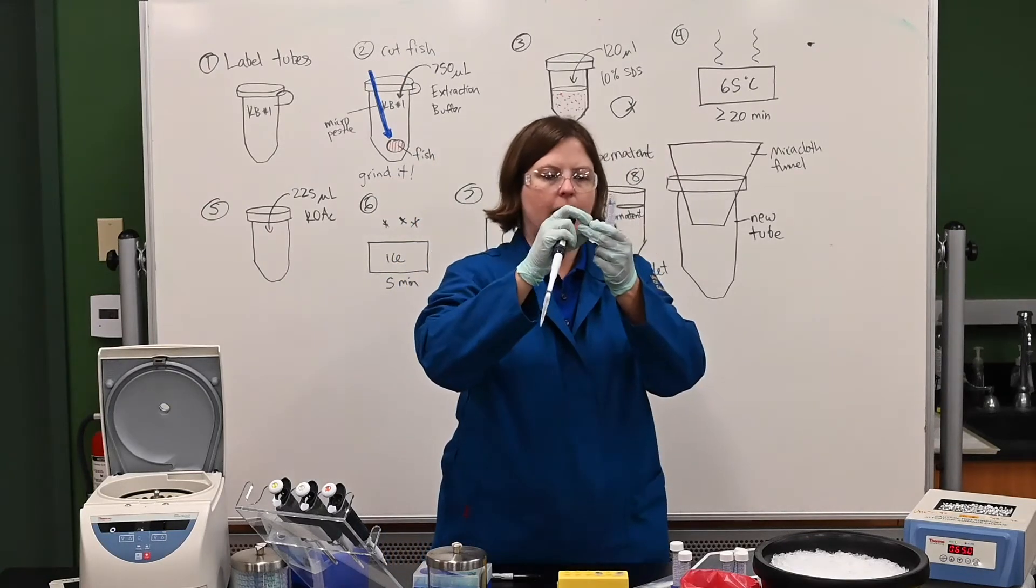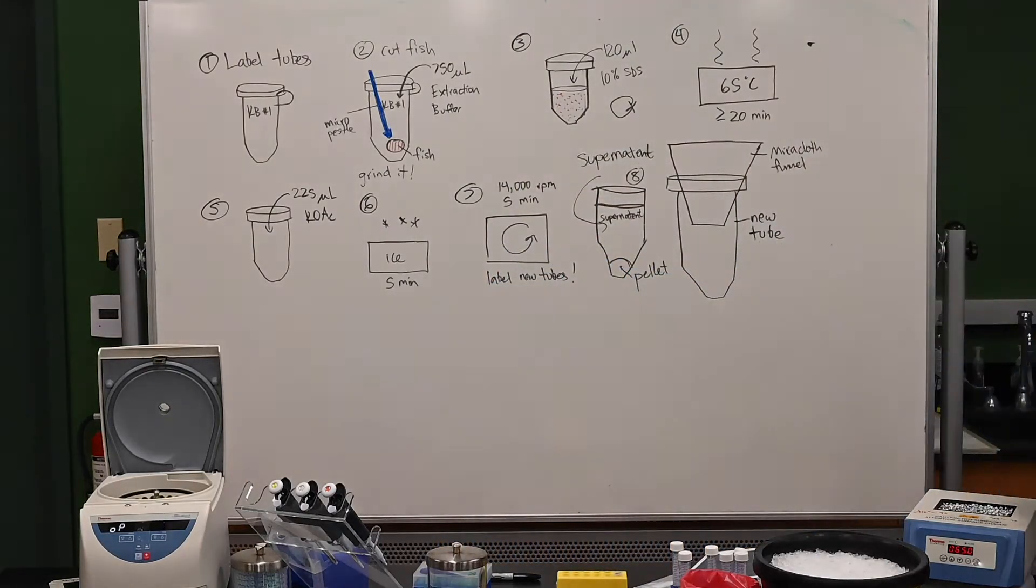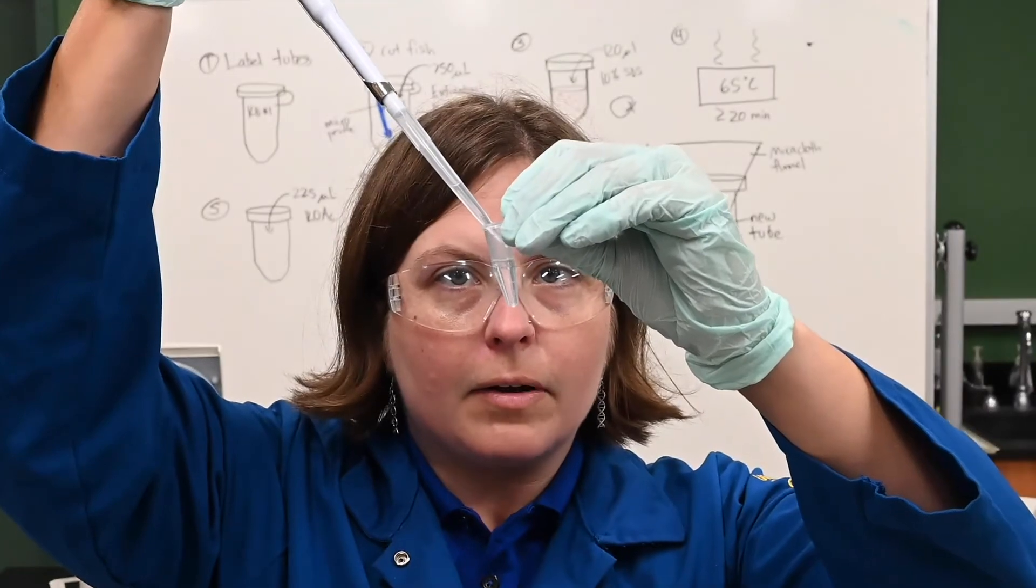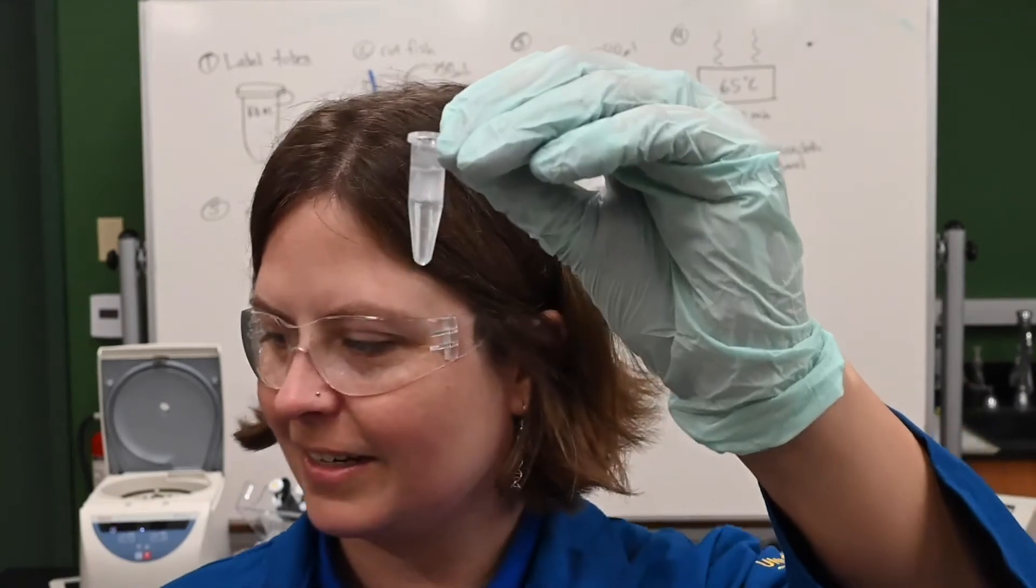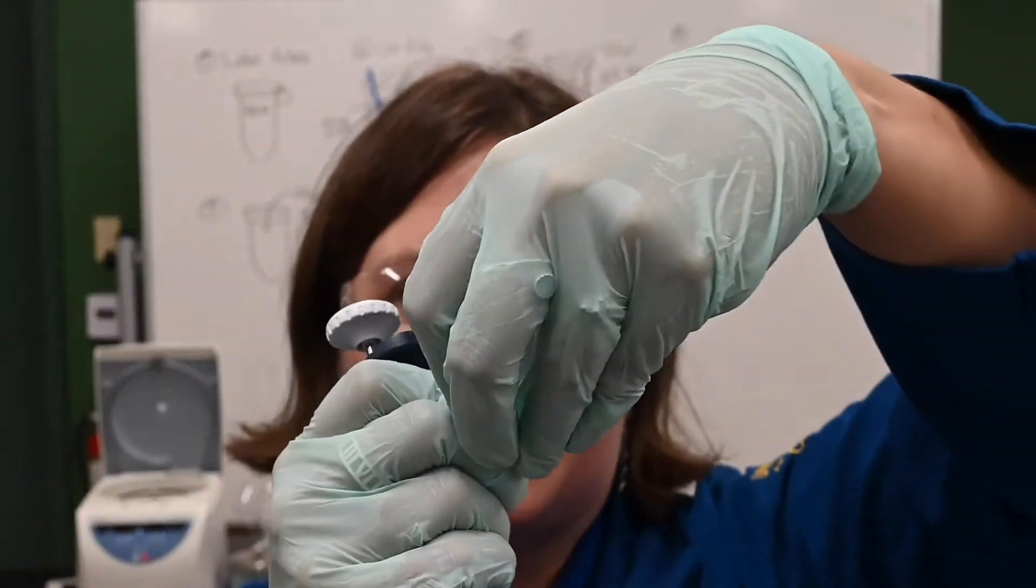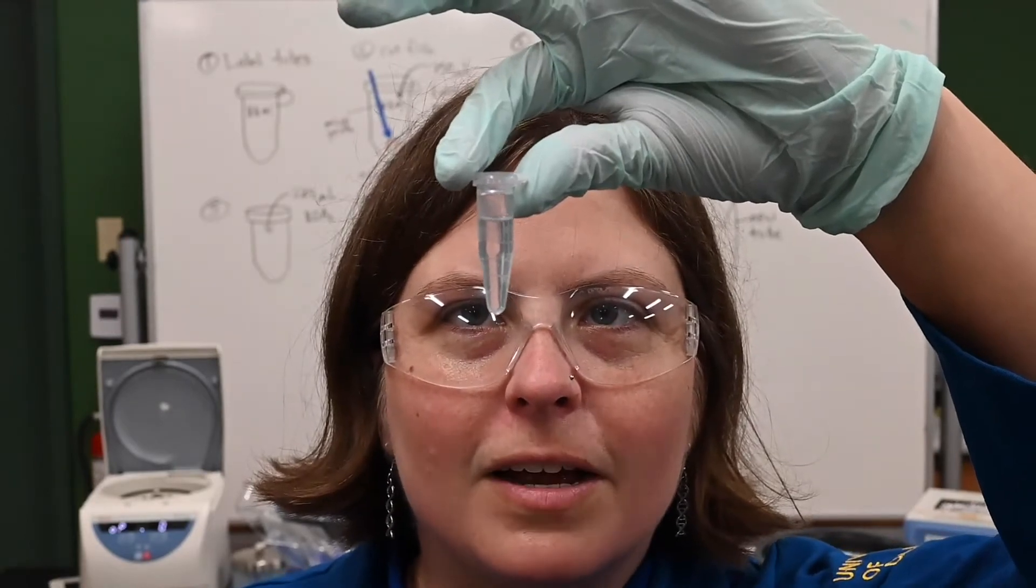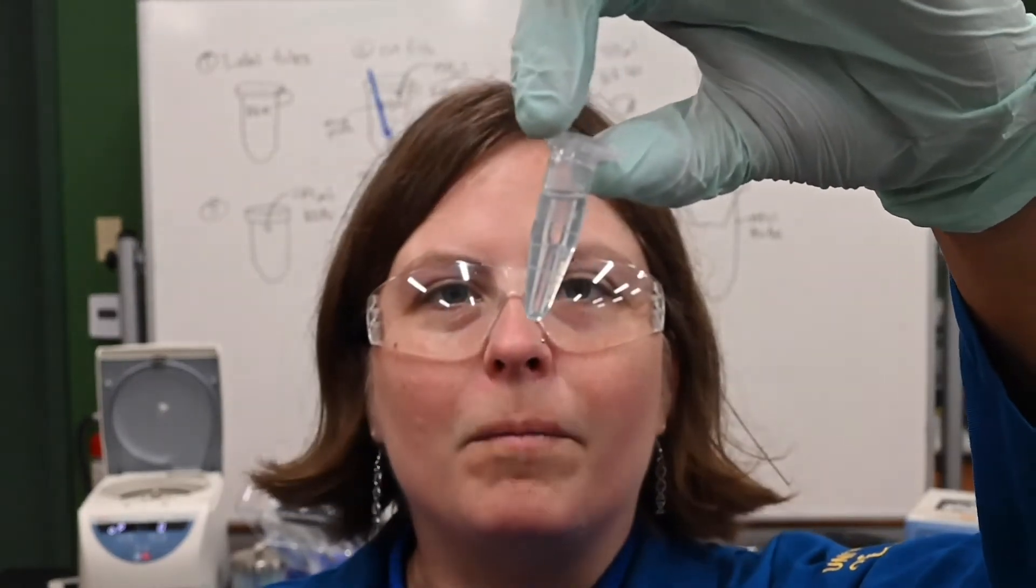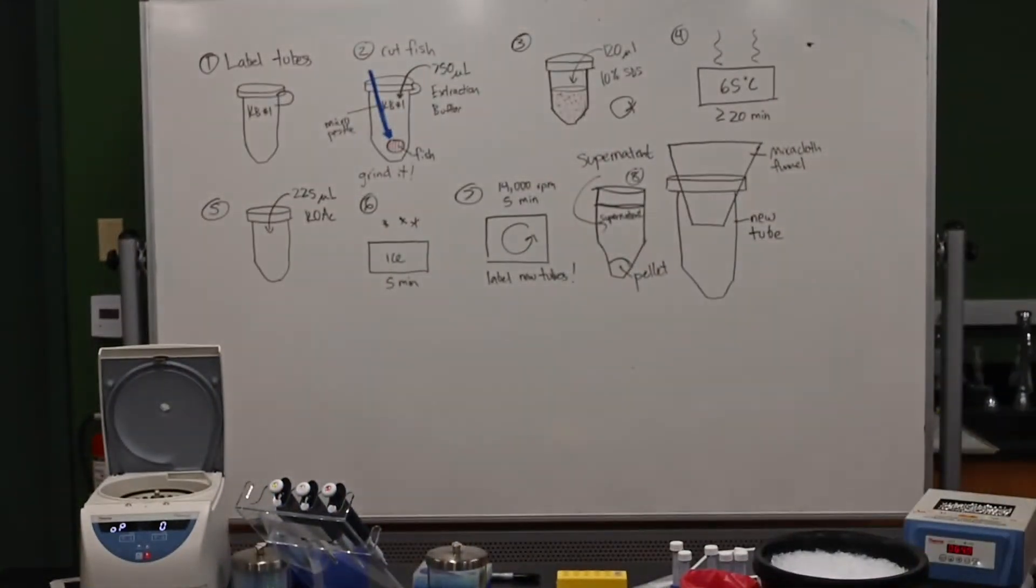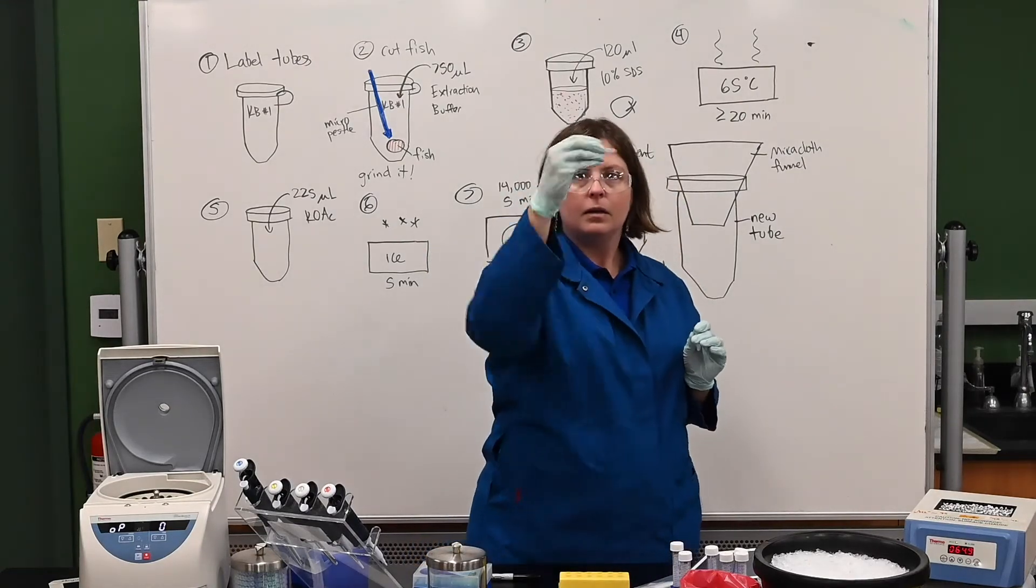So alcohol is going to bind to our DNA and cause it to start to clump together. Now, what you should see when I add this is it should start turning cloudy and that cloudiness, yeah, that's our DNA. So you can see there's kind of two layers going on right now. Ethanol is lighter than the rest of the liquid that's in there. So it's top, it's cloudy. I'm going to mix this and it should all start to turn cloudy. Now I can see little specks of DNA floating around. You probably can't see them because they're really tiny. Now I've got our DNA starting to clump together. So we're going to spin again. And now we spin for five more minutes.